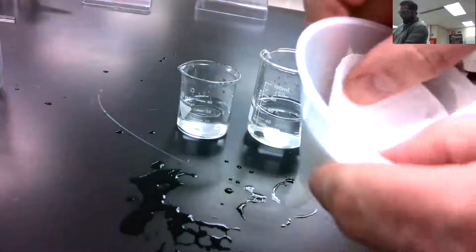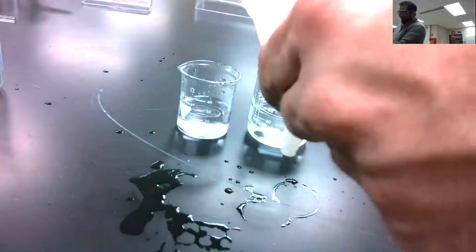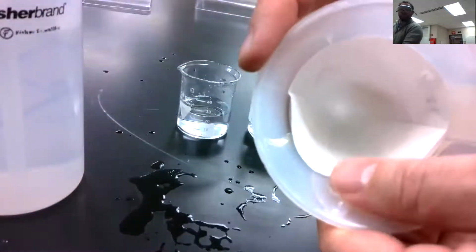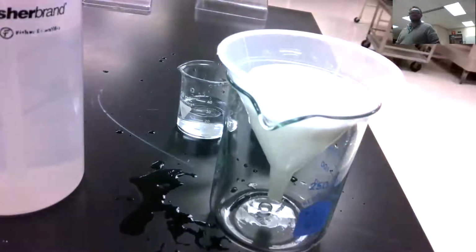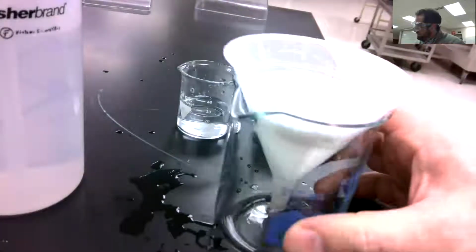If you ever have problems, you can see it kind of bounced out there, it's not staying in shape, add a little bit of water. The amount of water that we use is not terribly important today. So add a little bit of water. That helps it hold its shape. We're going to place the funnel into the 250, the largest beaker that we have. And we're ready to go there.